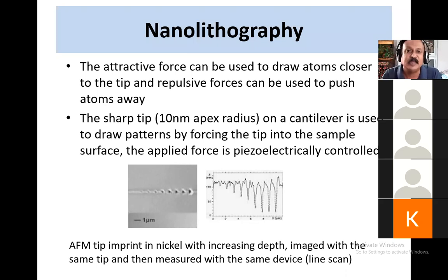Therefore, the change in the length of the crystal is very, very small. It is a few nanometers. It is that small. And it is because of that movement of the piezoelectric crystal that the probe placed on that crystal will move, or scan the surface.